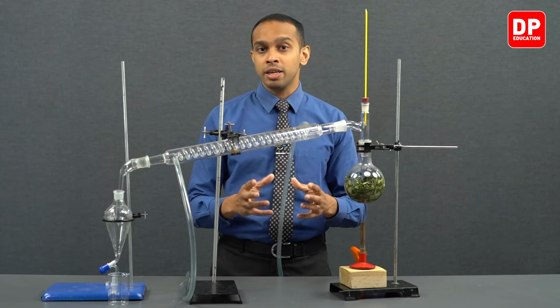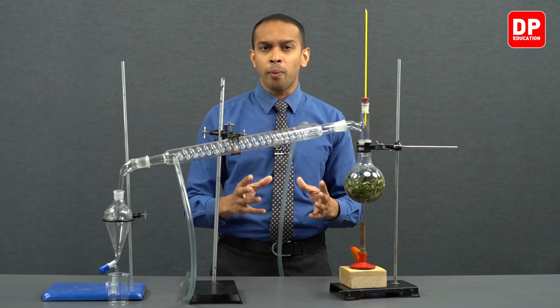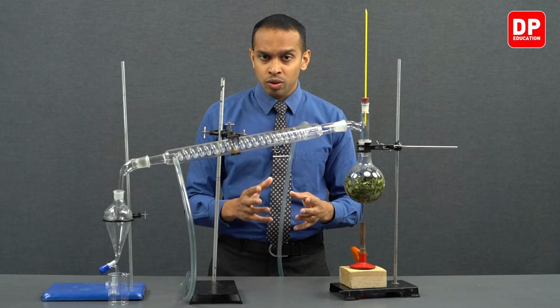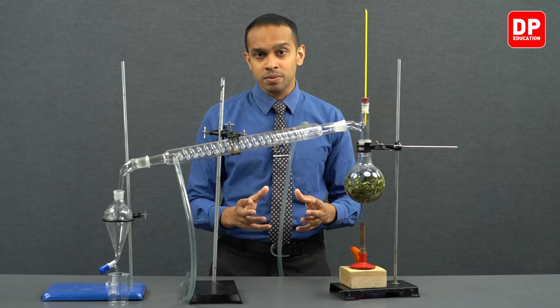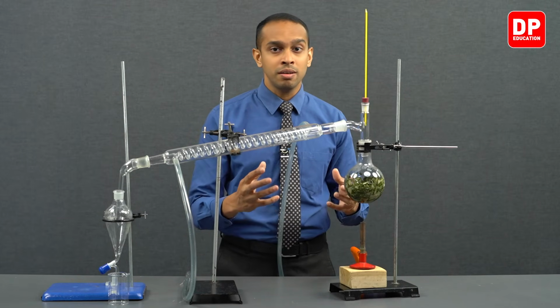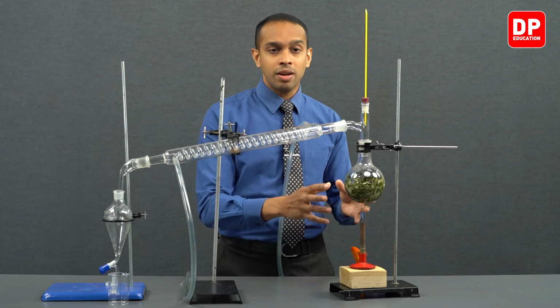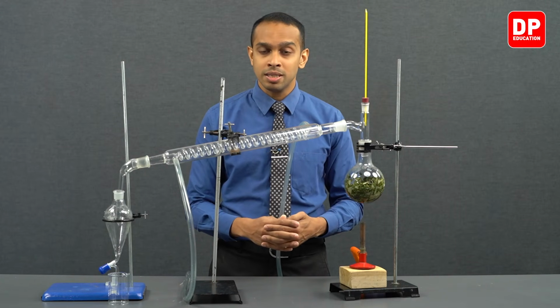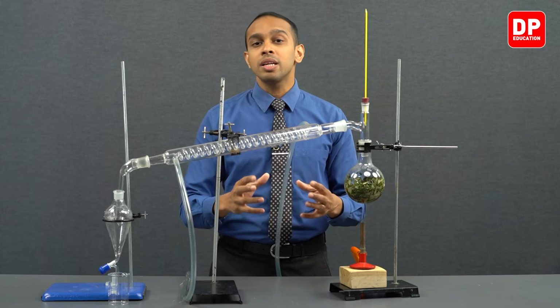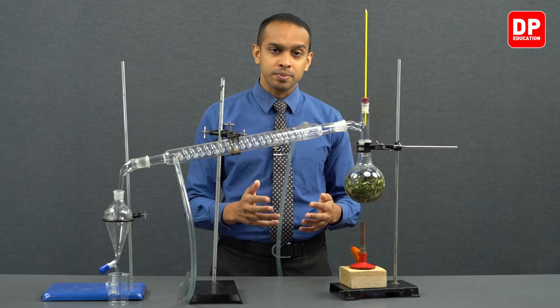Now, if you were to take eugenol or any essential oil and boil them, before they reach their boiling points, they will decompose. So, if you were to extract it just by vaporizing them and then cooling them down without this steam distillation process, before the essential oil reaches its boiling point, the essential oil will decompose.